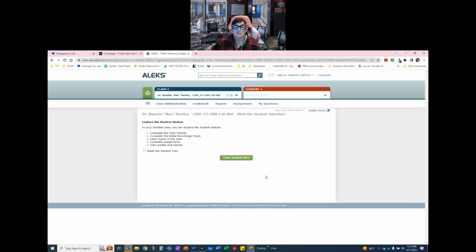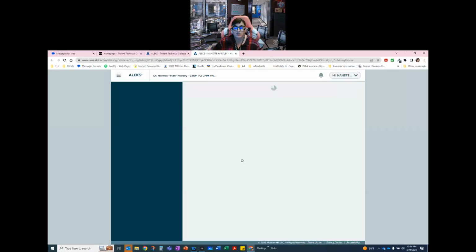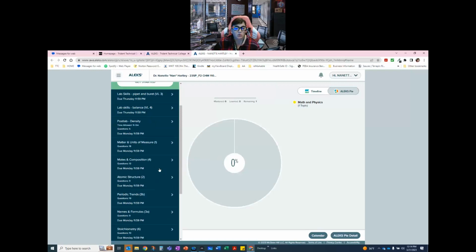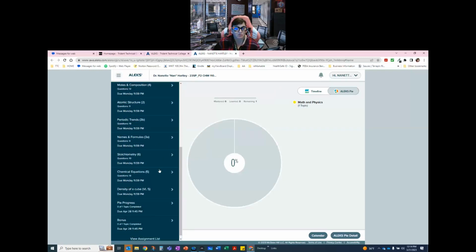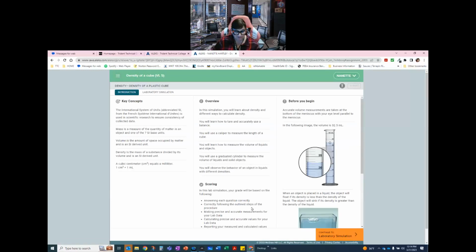So I'm going to go ahead and enter the student view so that we can talk about what's in here. There's not much to this experiment other than doing what they tell you to do. The big things that we find to be issues in working with the virtual labs, and there are a couple of them, is that it's looking for a different number of sig figs than what you think it should be taking.